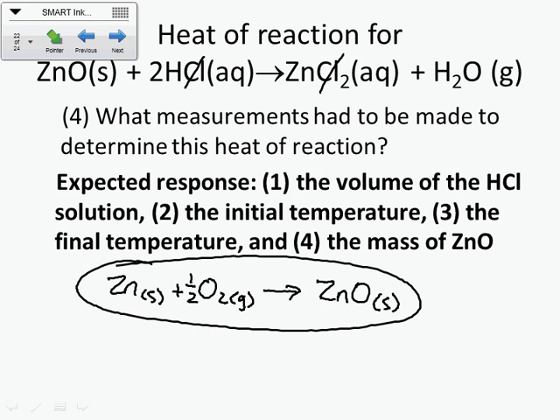And that's going to be your insulation. Weighing boats, you'll have those available to you, or maybe just beakers to weigh the mass of the stuff in. 50 milliliter graduated cylinder, analytical balance, and a thermometer, okay? So those are the things you'll have available to you.